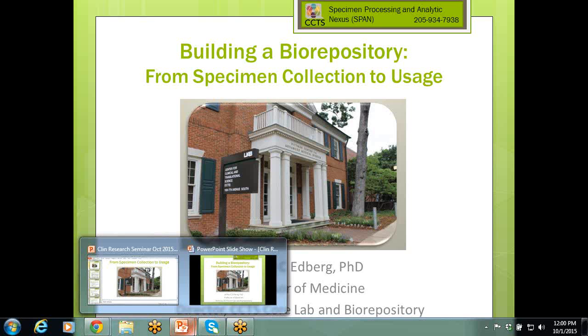So I'd like to talk about biorepositories, obviously, but before one even builds a biorepository, it's really worth stepping back and asking, what are you trying to accomplish? What are you actually doing? What are you storing? Why are you doing it? Because at the end of the day, if you store a bunch of stuff, whatever that stuff is, and it turns out not to be useful for any questions anyone wants to ask, then that was not worth the time. So it's really worth spending a lot of time thinking ahead of time, what is it that I'm really trying to do, and what am I trying to accomplish?